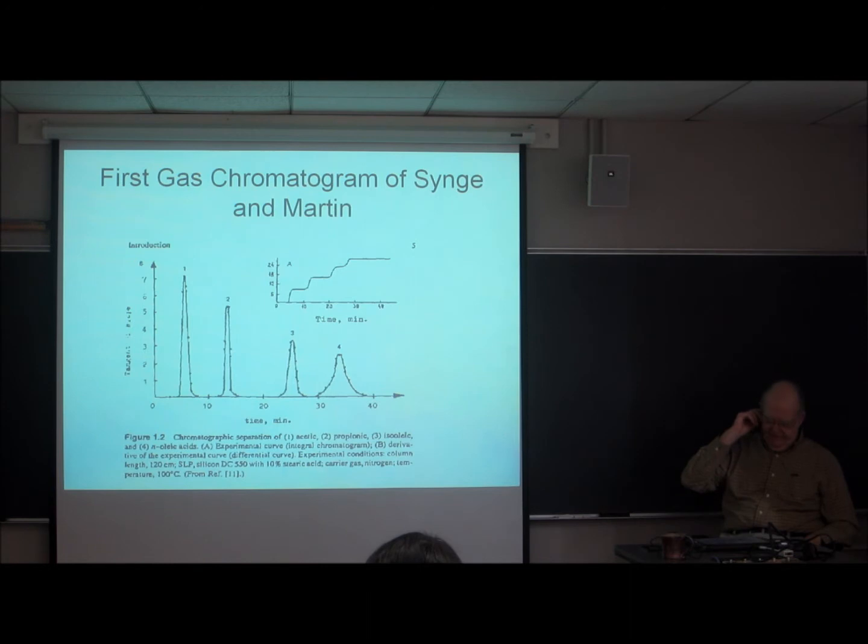We've now entered a whole new phase of the course, and for maybe 4 weeks or so, what we're going to talk about are different kinds of chromatography. And we're going to start, as I said the other day, with gas chromatography. And then we're going to move into various kinds of liquid chromatography, and then eventually we'll get to capillary electrophoresis, which is not chromatography, but is very closely related.